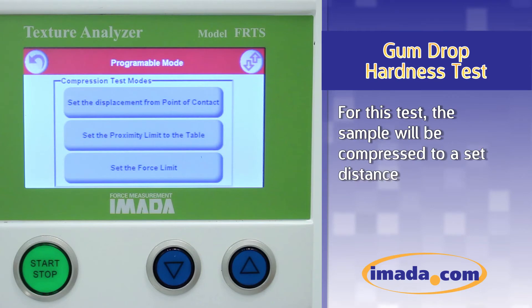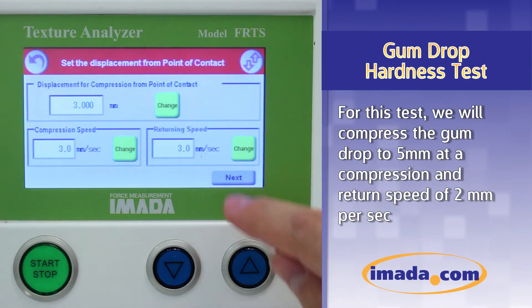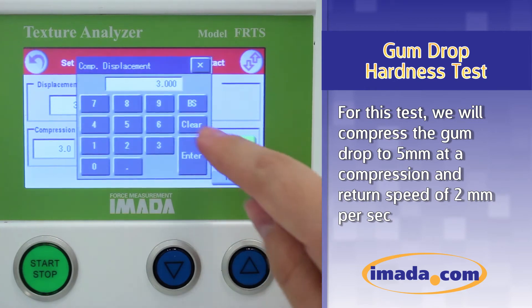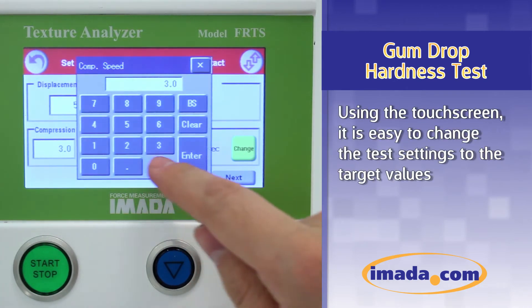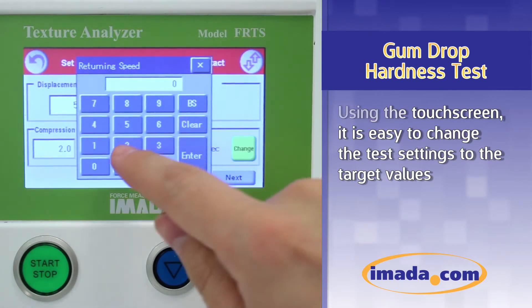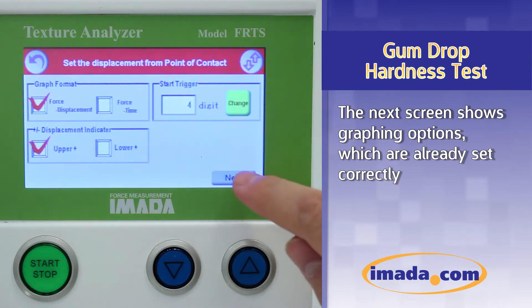For this test, the sample will be compressed to a set distance. On the next screen, the test parameters are set. For this test, we will compress the gumdrop to 5 millimeters at a compression and return speed of 2 millimeters per second. Using the touchscreen, it is easy to change the test settings to the target values. The next screen shows graphing options which are already set correctly.